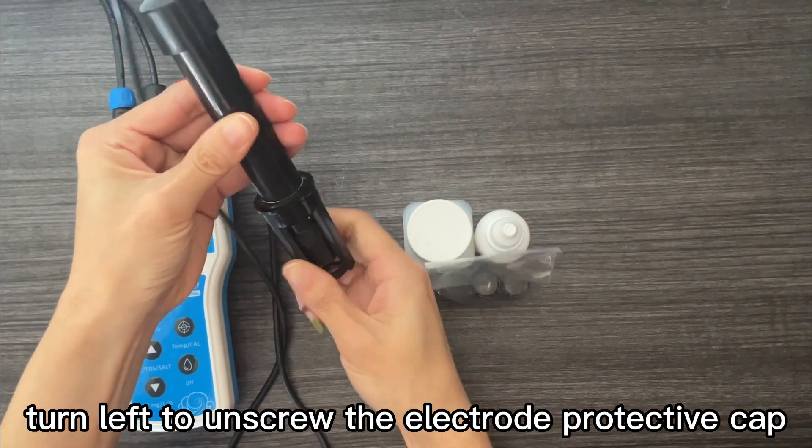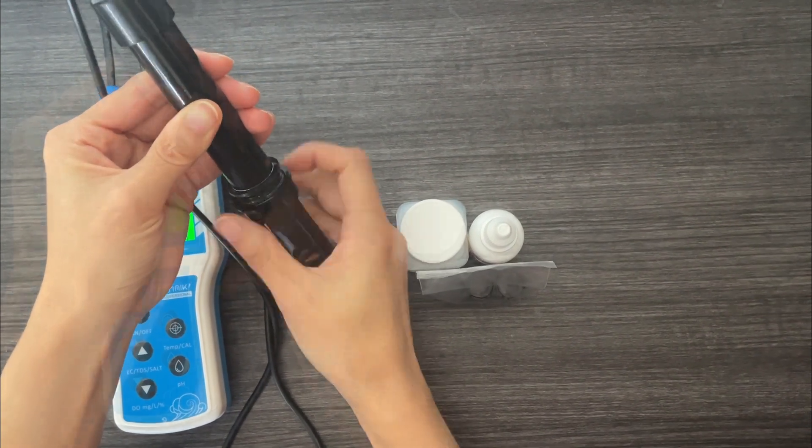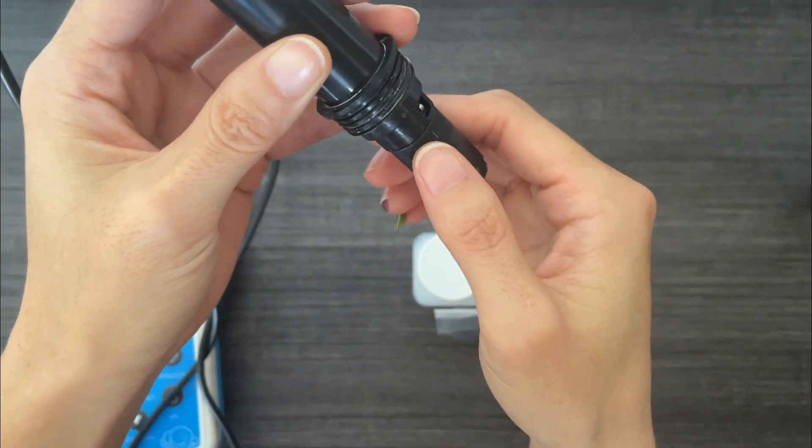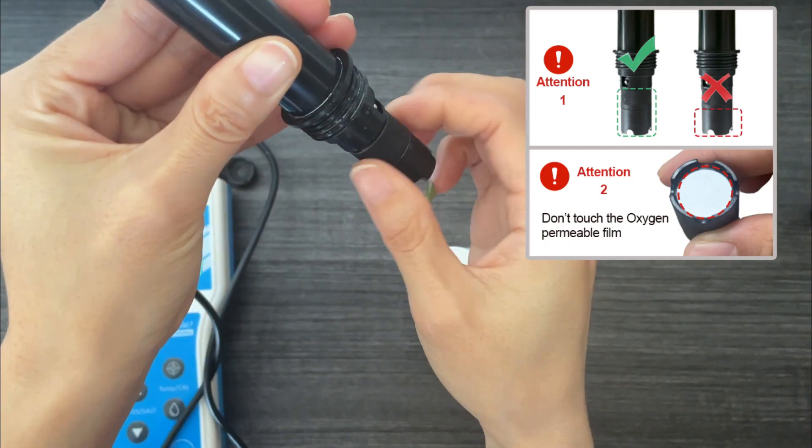Turn left to unscrew the electrode protective cap. Remove the old membrane. Pay attention to the entire part of the rotating membrane.